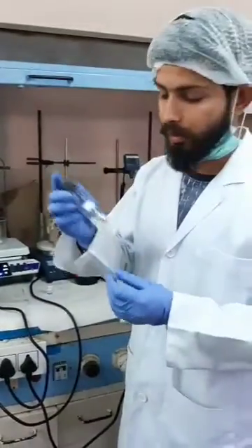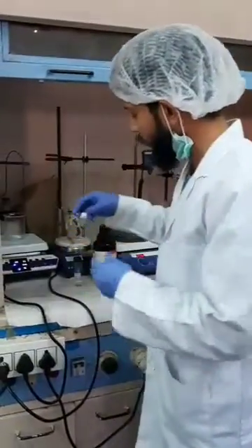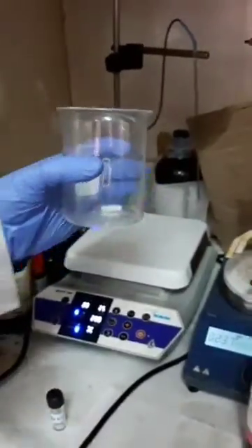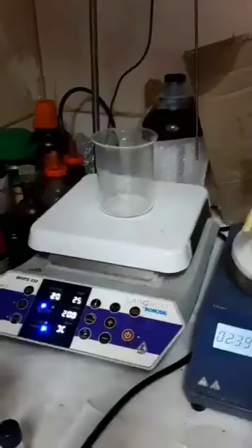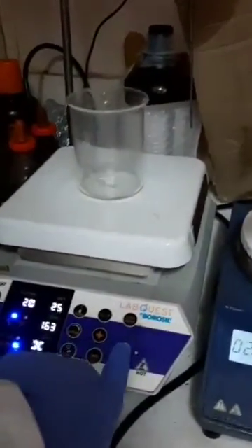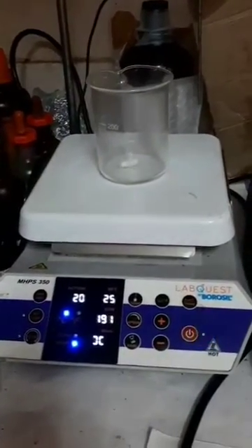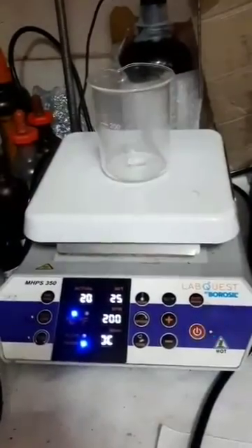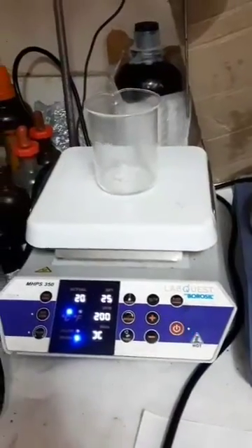After that, I am taking a vial in which surfactant and co-surfactant are mixed properly. The surfactant and co-surfactant solution is added dropwise into the oil phase using a magnetic stirrer with continuous stirring. This is done for about 50 minutes at a temperature of 20–25 degrees Celsius at a fixed speed of 200 rpm.